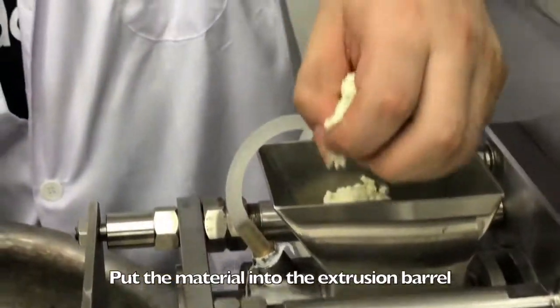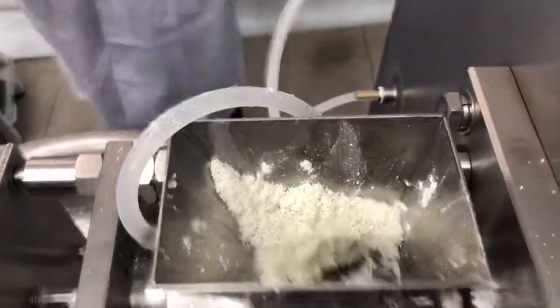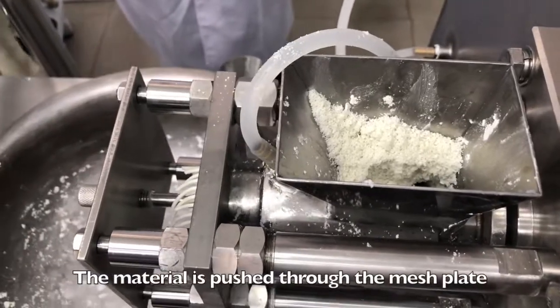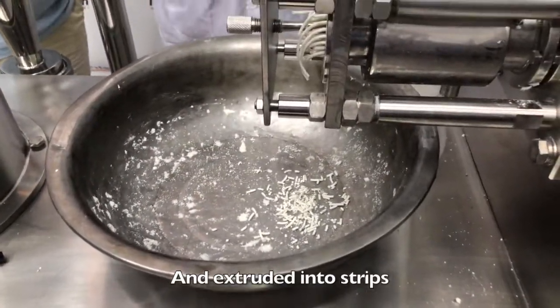Put the material into the extrusion barrel. The material is pushed through the mesh plate and extruded into strips.